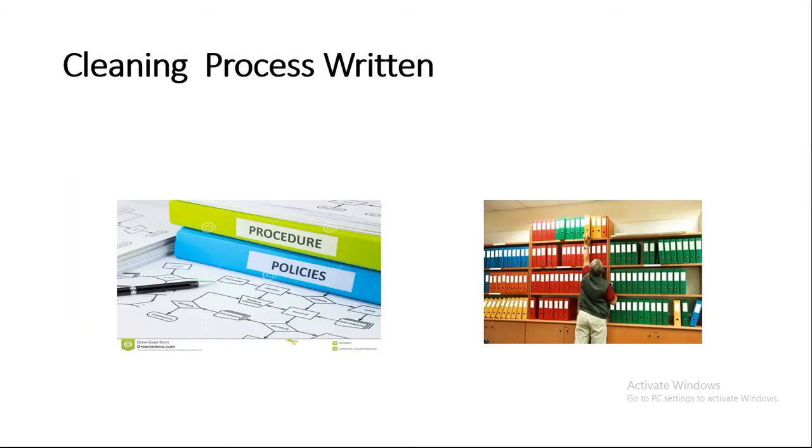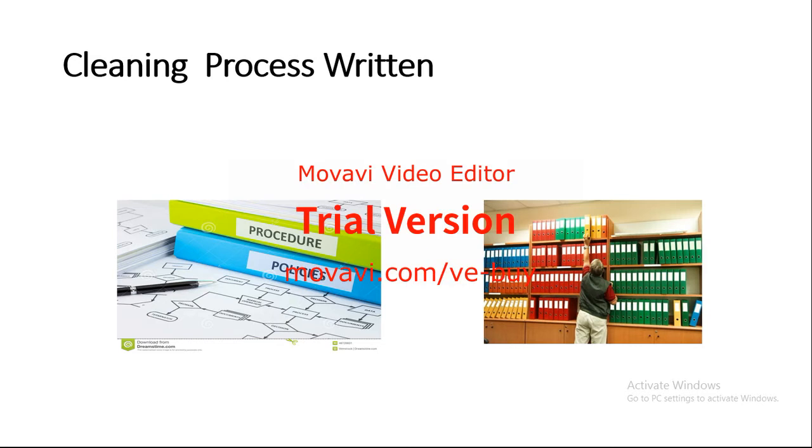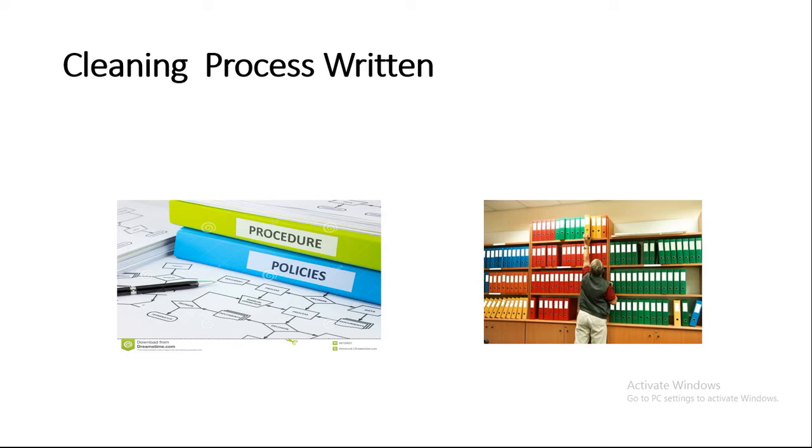A cleaning process written procedure and documentation. Examine the detail and specificity of the procedure for the cleaning process being validated, and the amount of documentation required. Some have general SOPs, while others use a batch record or log sheet system.